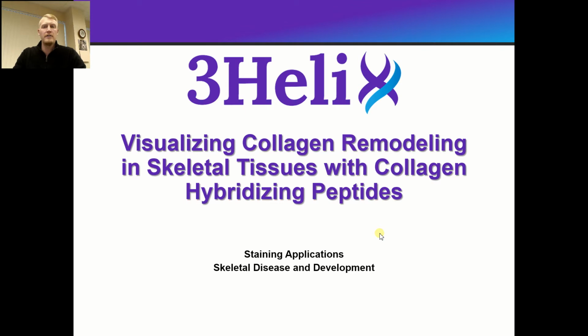In this short video I just wanted to talk to you about how you can use collagen hybridizing peptides to visualize collagen remodeling within the skeletal tissues. Now this could be helpful for skeletal diseases or even monitoring bone development. So before we get started, I want to talk to you guys about the background involving collagen.